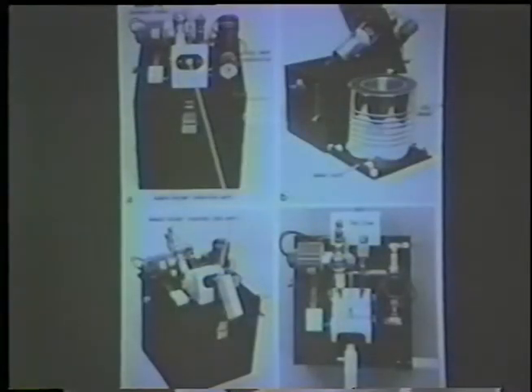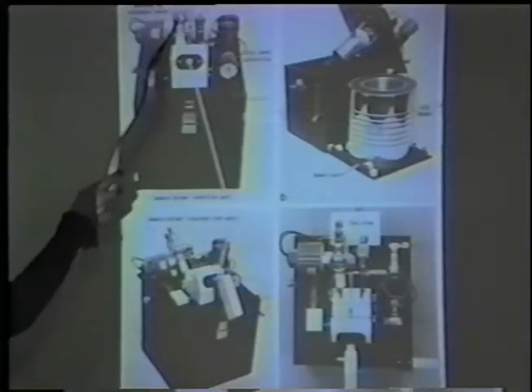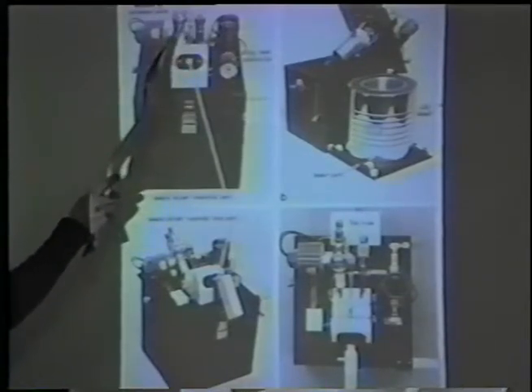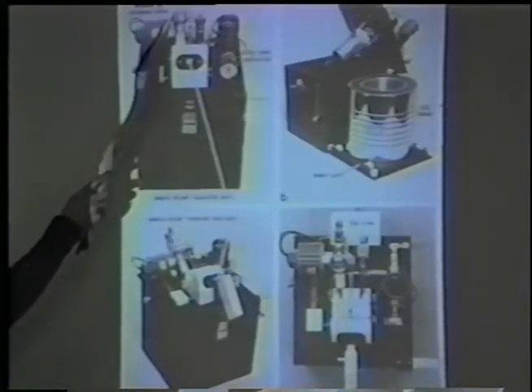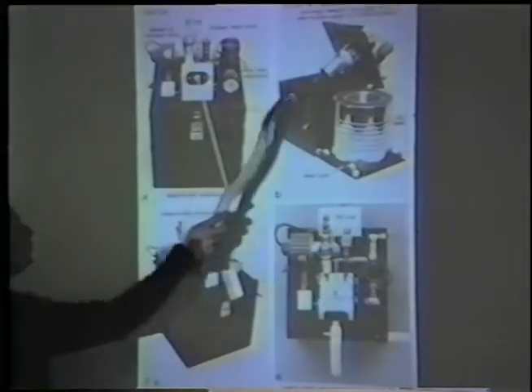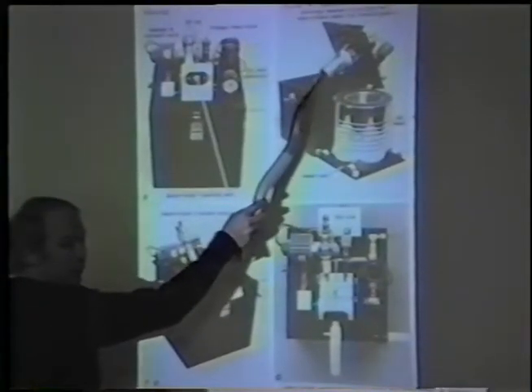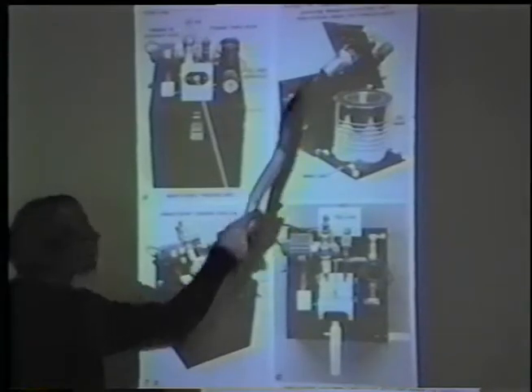So, yeah. Okay. Here is a picture of the machine itself, just like the ones in the hood over there. There is the gaseous nitrogen solenoid valve. There is an RTD temperature sensor, which is used to run the temperature controller which drives the cartridge heaters. Cartridge heaters are in this cylinder wall. This is the cylinder in which the cryogen is liquefied and kept above its freezing point.